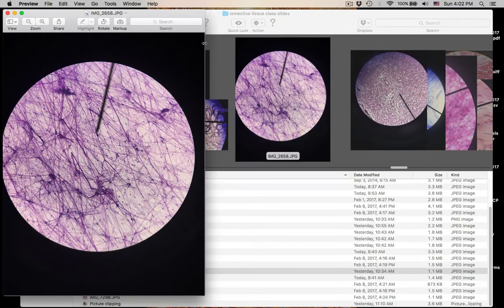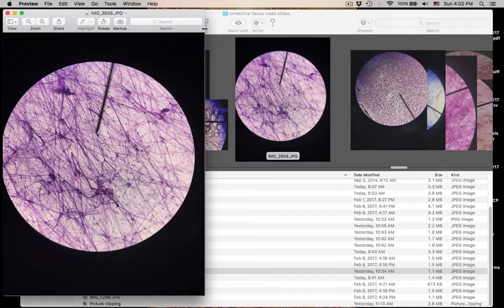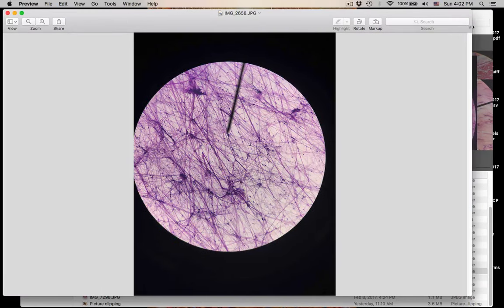Name this connective tissue — you've seen it again — and this is number twenty. Tell me the name of this connective tissue again, and where you could find it. Name of it, and where you can find it.